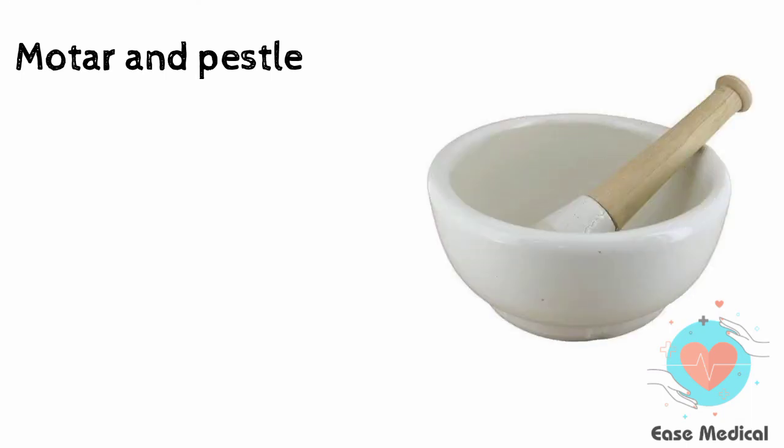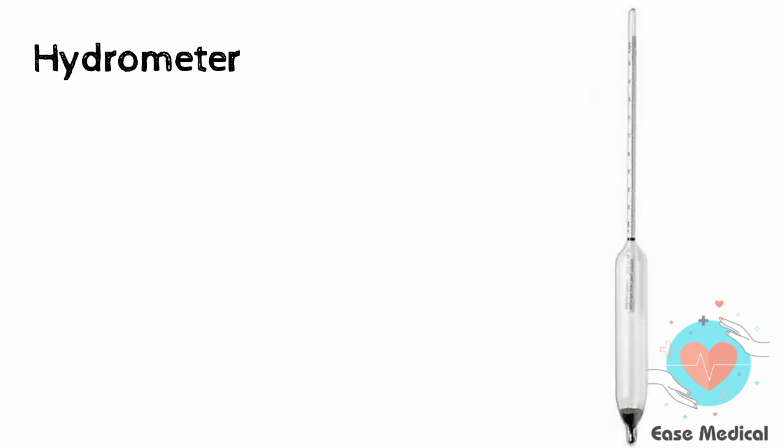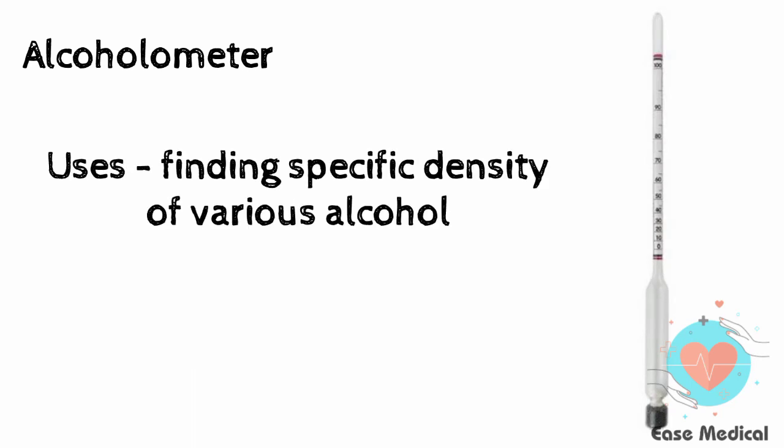Now, mortar and pestle are used to crush, grind and mix solid substances. Next, hydrometer is used for measurement of specific gravity of liquids. Now, alcoholometer has markings from 0 to 100, used for finding specific density of various alcohols.